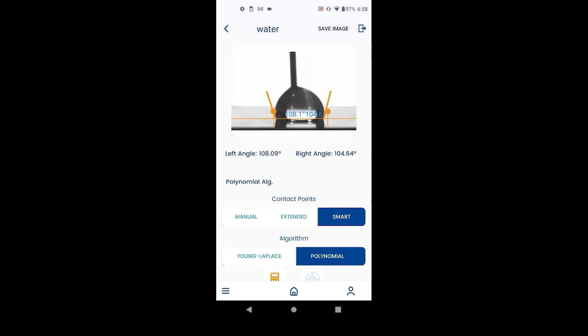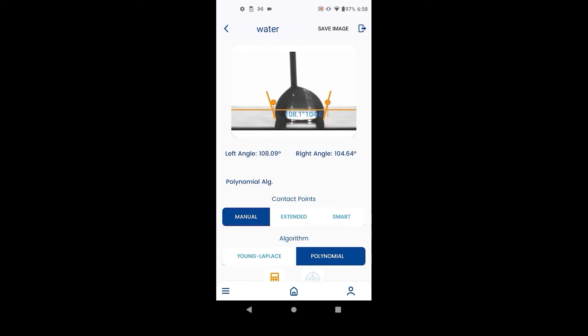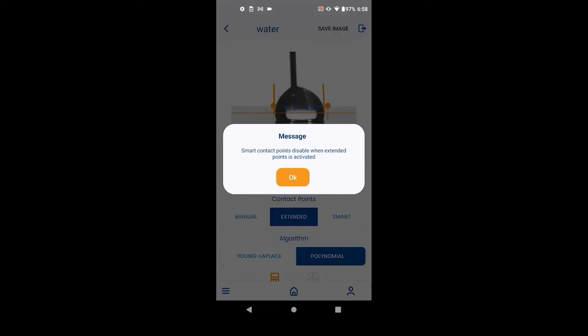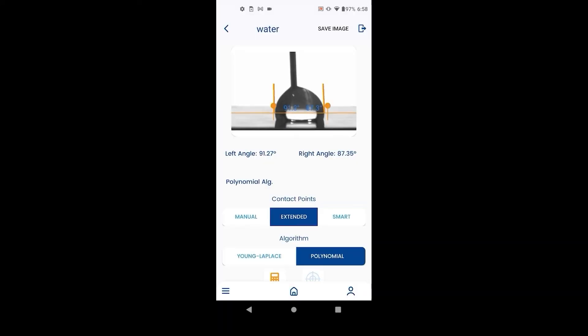In case smart contact points does not work, there are two alternate methods. Manual: this forces the measurement where the user decides. Extended: this is an alternative algorithm that uses more of the droplet profile to find the contact angle.